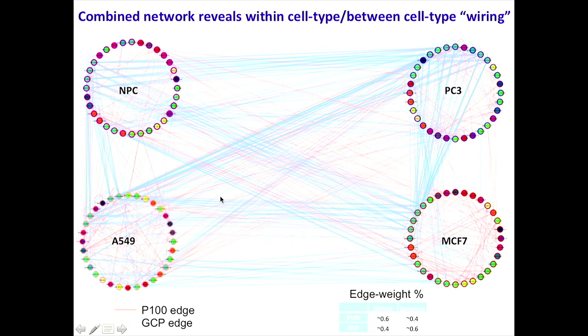And so just one more thing about these data is again, I've sort of been alluding to this fact that there's cell-specific biology, and then there's biology that transcends cell types. So we try to quantify this in some sort of way. If we take those maps that I just showed you and organize them in a slightly different way, what I've done is grouped all of the nodes by their cell types. Here I've limited it to 4 of the cell types here. And then I can draw a line between any 2 given nodes when there is a strong correlation between them.